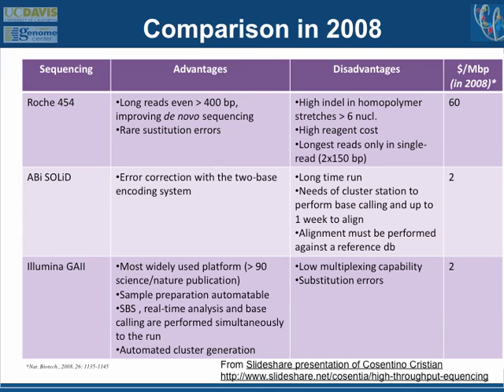And now, for example, for microbial studies, for ribosomal RNA sequencing, most people have shifted to doing Illumina sequencing of PCR amplification of ribosomal RNA rather than 454 sequencing. Even with the longer reads that you get with 454, because of the higher quality and the sheer volume you get with Illumina, people have shifted over to that.